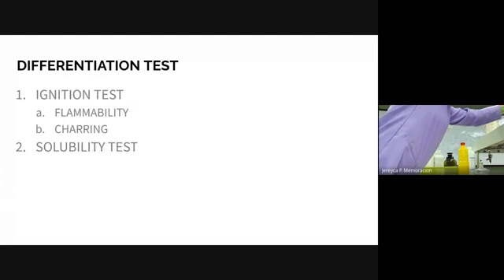Next, we are going to do the solubility test. Since we don't have kerosene, which should be compared with distilled water, each with mothballs, we are going to test cooking oil instead.